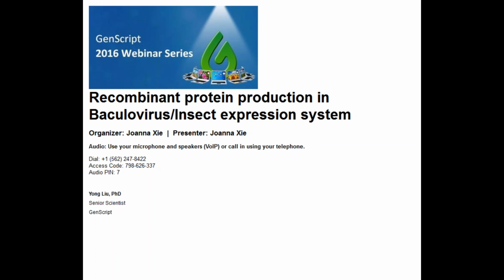While there are various factors that go into the decision-making process, the nature of the target protein and its solubility, its functionality, the protein yield requirements, user experience, intended application, and the speed of generation are often some of the most important factors that govern that decision. And generally, E. coli system is the commonly used expression system because it's easy to operate, fast, and low cost to scale up. And with similar features, protein expressed in yeast is also used.